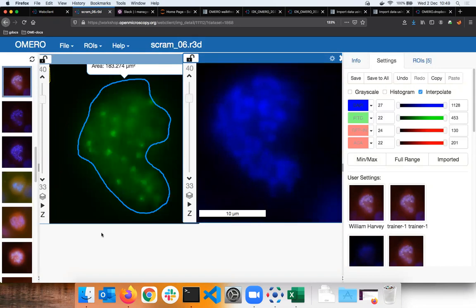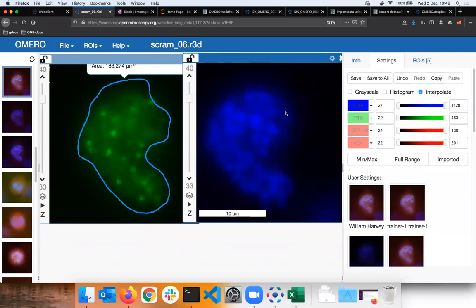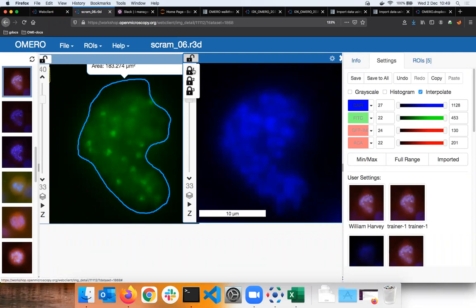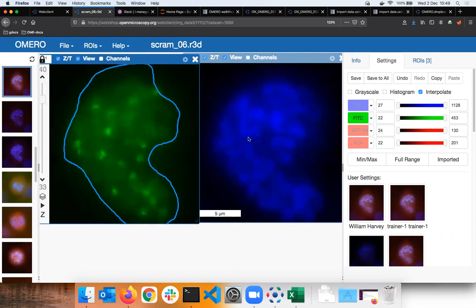Of course, I could repeat it several times and have the other channels here. If I move the viewport with the blue channel now, you can see that it's not synchronized with the green channel. I can change it by clicking on the top left icon and selecting the first synchronization group, which is signified with the first lock. If I do it in both channels, I can now verify that they are synchronized.